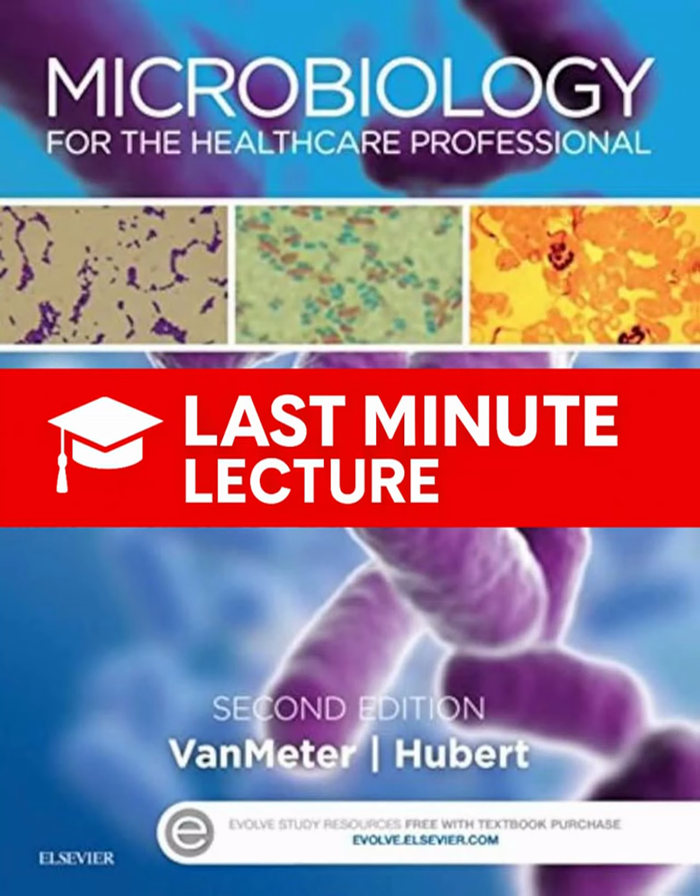Though these are descriptive, maybe less critical than biochemicals. A classic biochemical test mentioned is the gelatin stab. You stab bacteria into a tube of gelatin media. If the bacteria makes the enzyme gelatinase, it breaks down the gelatin protein.